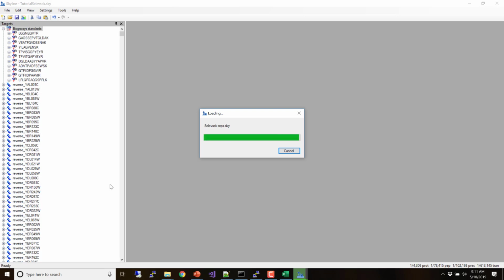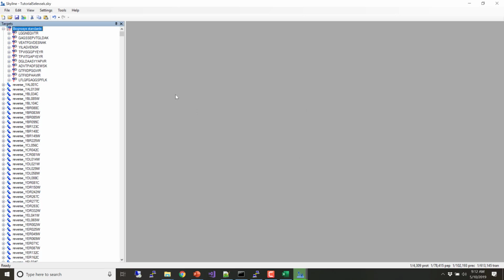So if they get really low CVs, that's more impressive than 3 replicates measured right next to each other. So one of the first things we do when we open up this file is we'll have a look at when these replicates were collected and how far apart they were.